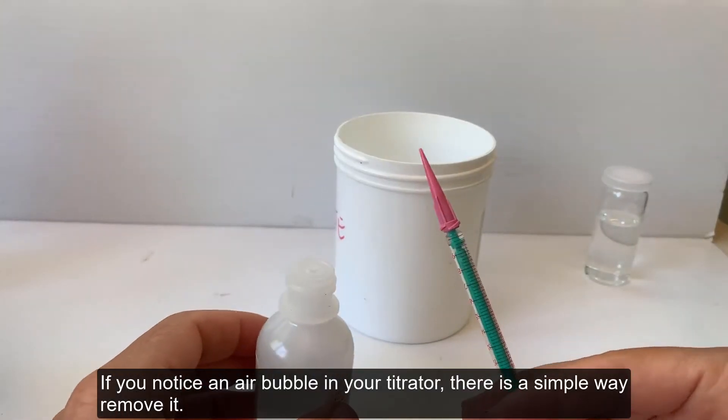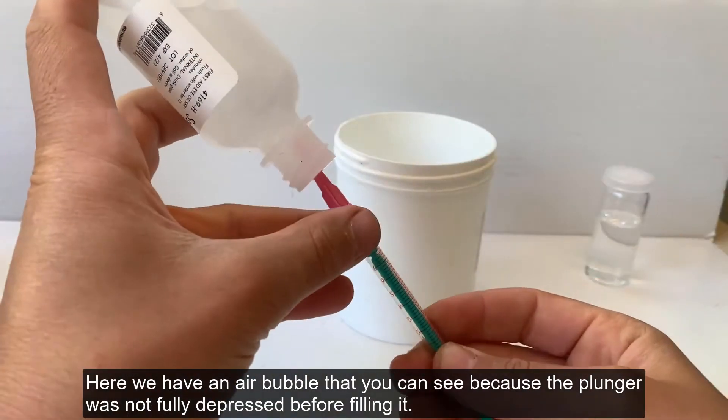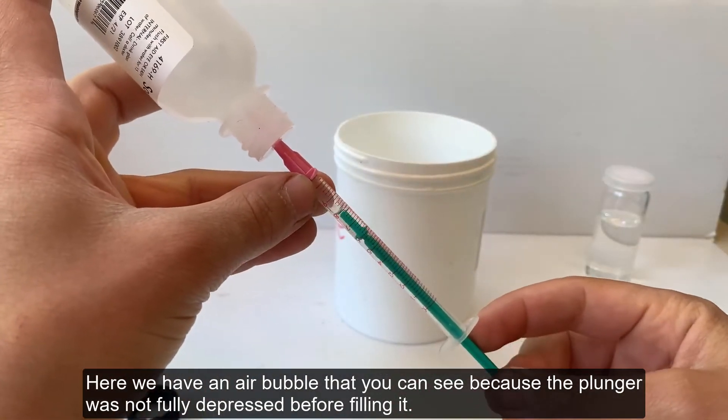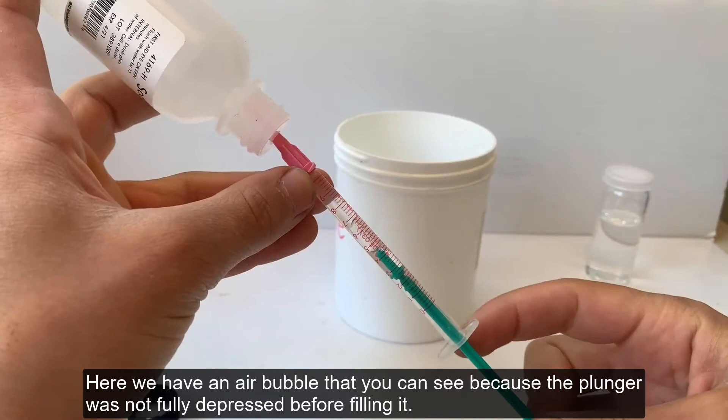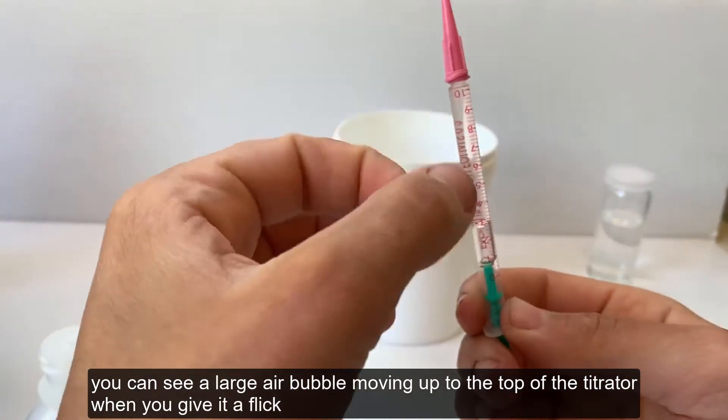If you notice an air bubble in your titrator, there is a simple way to remove it. Here we have an air bubble that you can see because the plunger was not fully depressed before filling it. You can see a large air bubble moving up to the top of the titrator when you give it a flick.